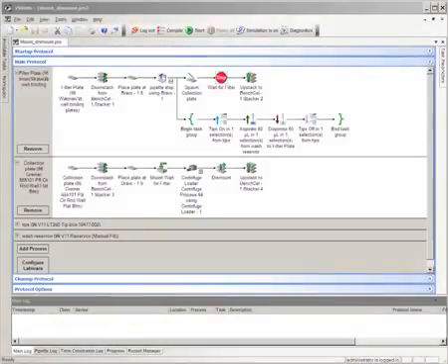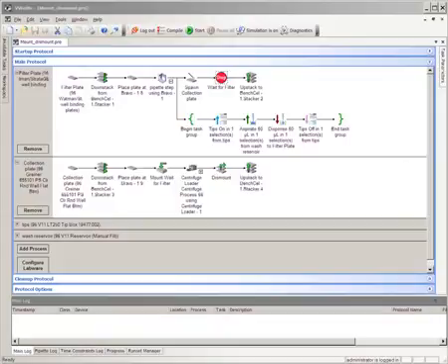In this tutorial, I will show you how to use the mount and dismount tasks to mount filter plates on collection plates for spin filtration.